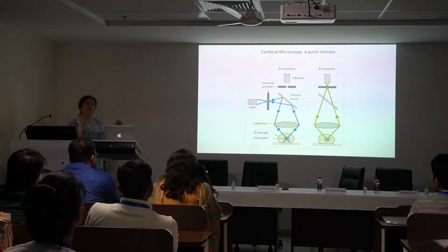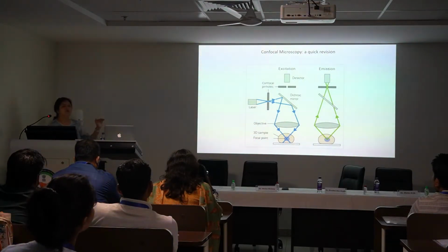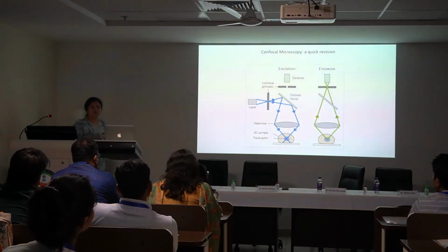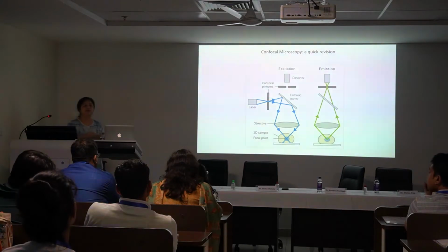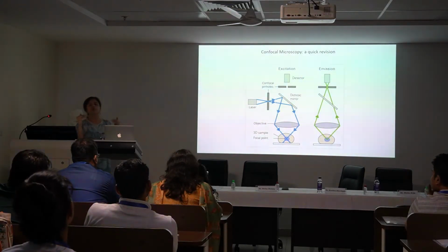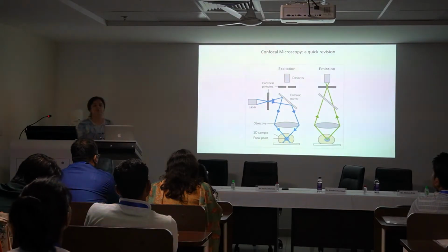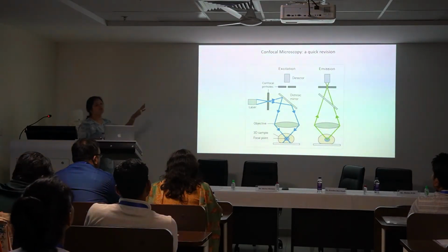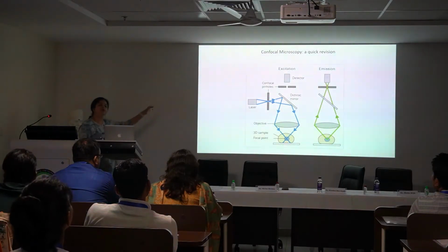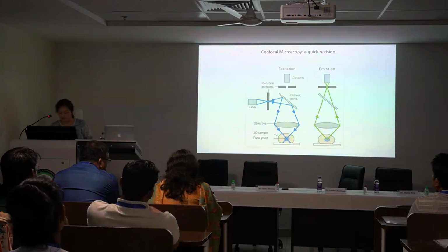So confocal microscopy is very dependent on the concept of the pinhole. If we open the pinhole, then we will get light from many different regions of the sample, and depending upon the application that we want and the amount of light that is present in the sample, we might choose to open or close the pinhole. If we are at optimal pinhole closure, then we can to some extent get the resolution which was documented in the previous slide, around 200 to 250 nanometers.